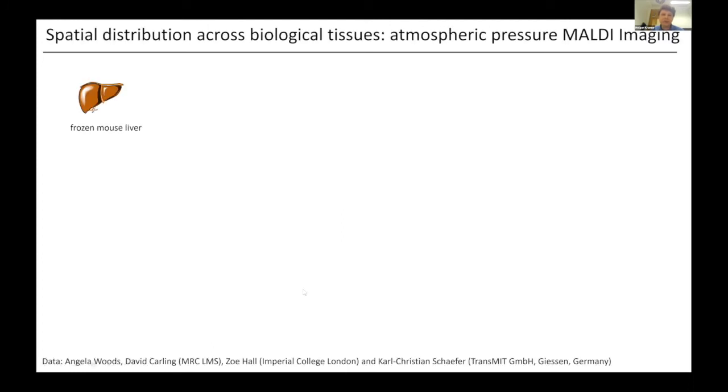So just to show how the sample preparation is performed, and it's worthwhile mentioning this is quite a specialized process. So when performing mass spectrometry imaging experiments, typically you would have a specialist focusing fully on mass spectrometry imaging to perform these types of experiments, and it includes both sample preparation, typically with cryosectioning to get a thin section of about 10 to 20 micrometers.